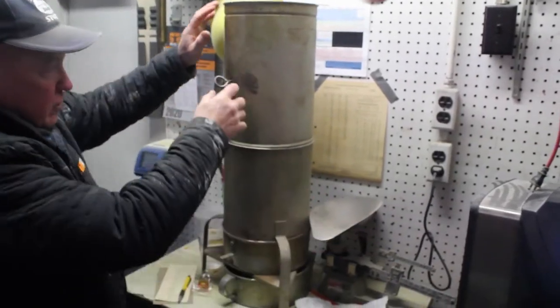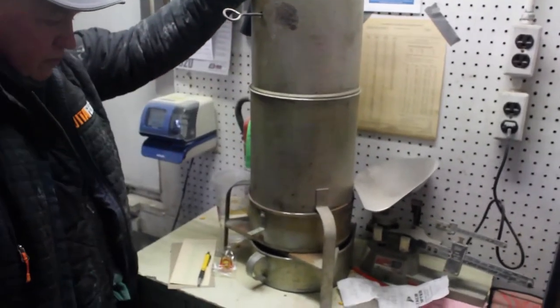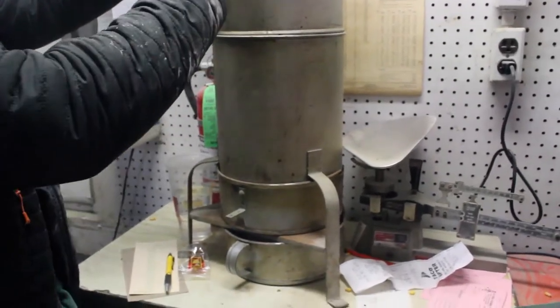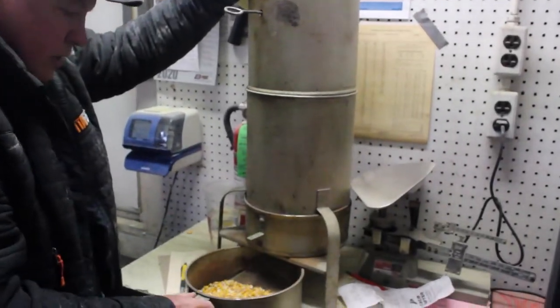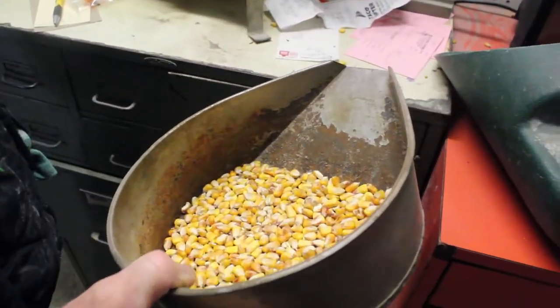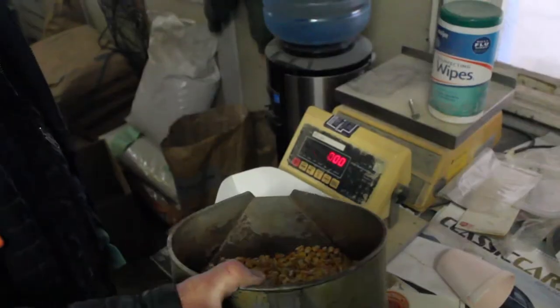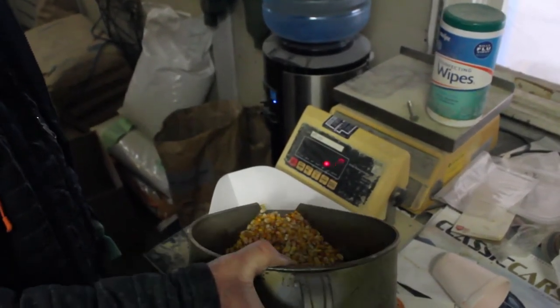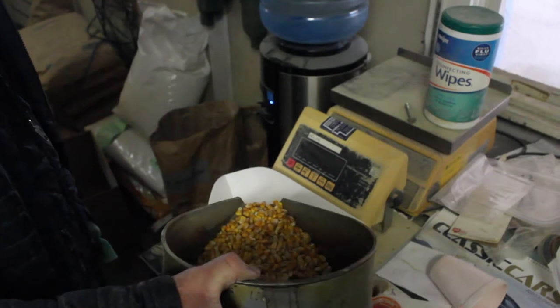This here is a divider — it'll split the sample. That's their divided-out sample. Then they're going to weigh out about 50 grams. This sample will be used in the vomitoxin test.